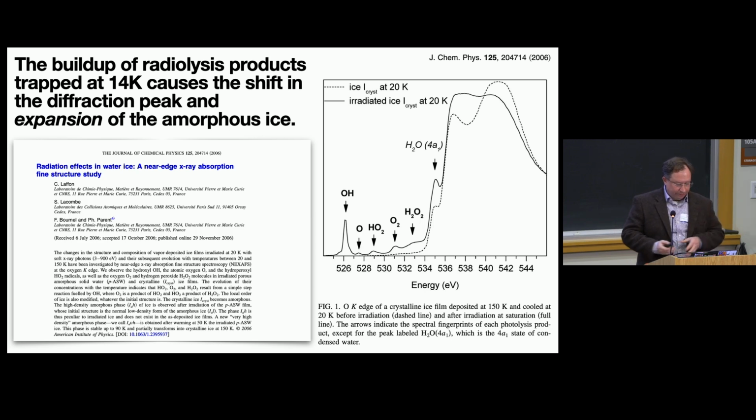Okay, so having delved into the physics of this and said, look, this is not a phase change, this is not a showstopper, it must be something else that's making our images worse. What is it? And more importantly, can we use some of the technology that we developed at liquid nitrogen temperatures to fix whatever this problem is, whether it's charging or movement or otherwise?